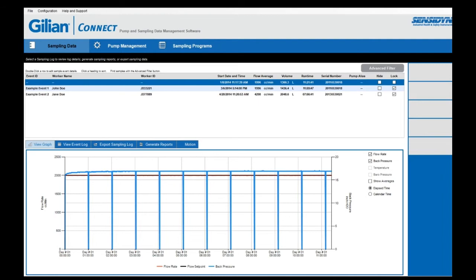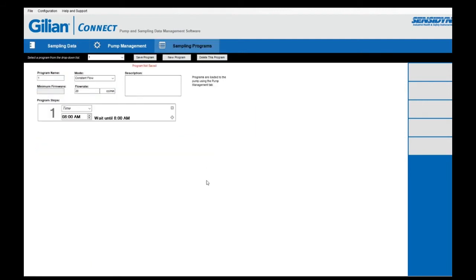Lastly, we are going to review how to establish a program in Gillian Connect and then transfer that program into your GillAir Plus air sampling pump. Once you've entered into your Gillian Connect PC software, select sampling programs. Once you're into your sampling program, you will be able to set your program name — you can type any program name, but you are limited to eight characters maximum. Once you've set your program name, go to the mode function. You can choose from constant flow, constant pressure low, or constant pressure high. For our sampling event, we will select constant flow.